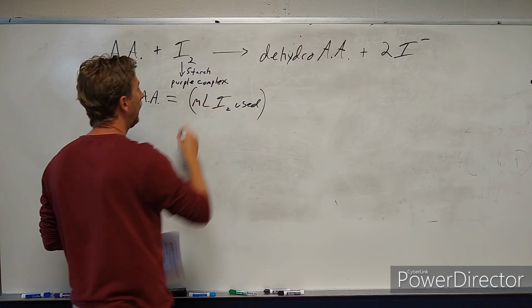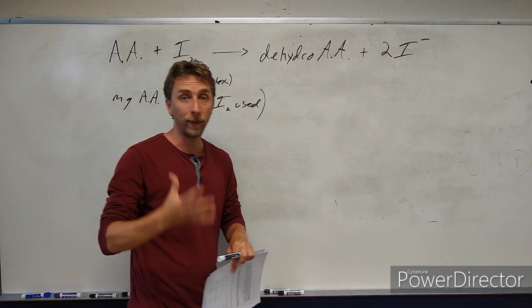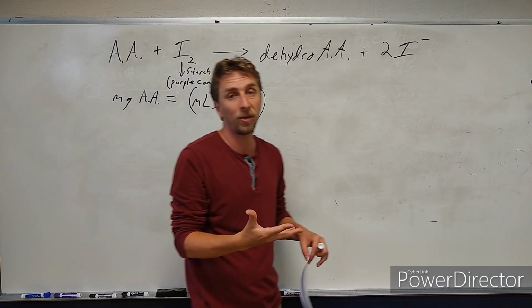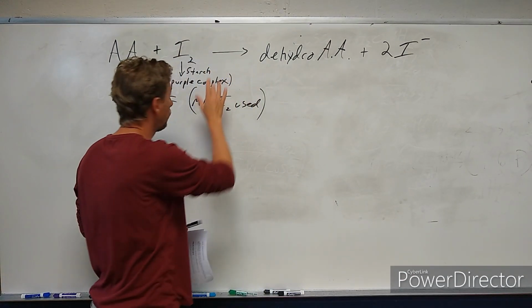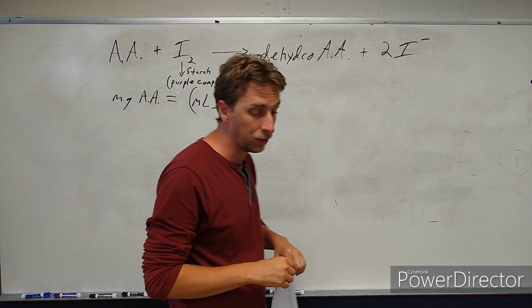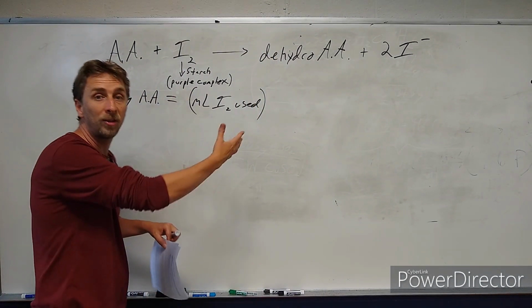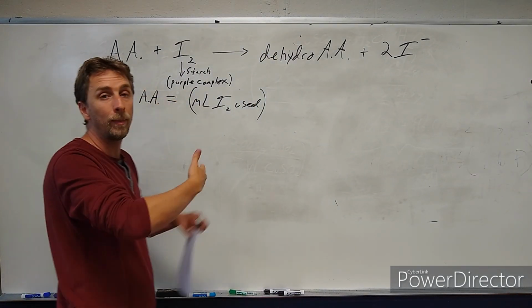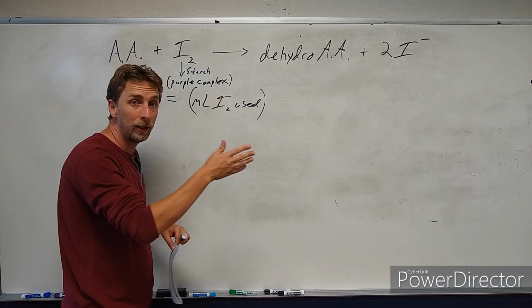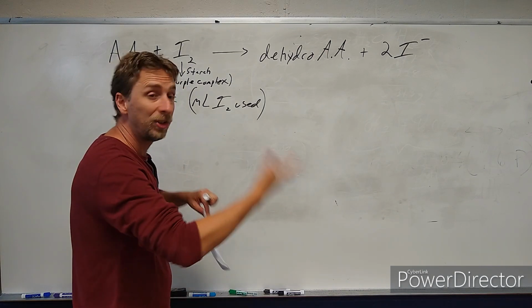All right? And that's if the ascorbic acid is all gone, then the iodine will hit the starch and it won't get pulled away from the starch anymore. It will just turn into that purple color, making this complex molecular structure of iodine and starch. And then we know that we've consumed all the ascorbic acid, because the purple color didn't disappear anymore. That's the end point. So how many milliliters did it take? That's what we use in this formula here, the milliliters of iodine used to reach the end point.